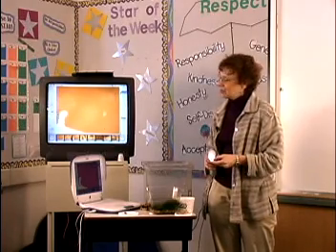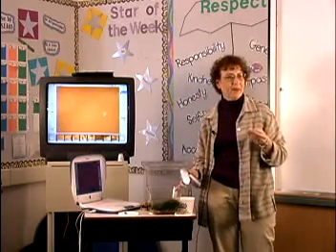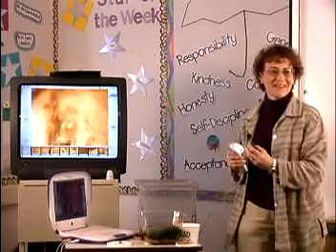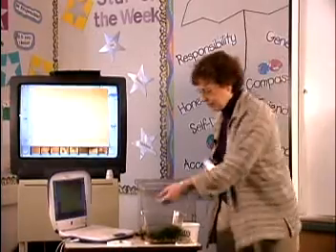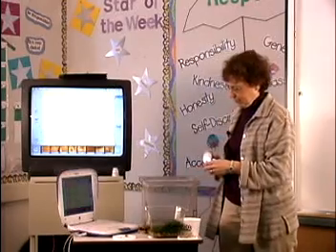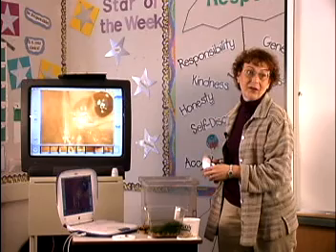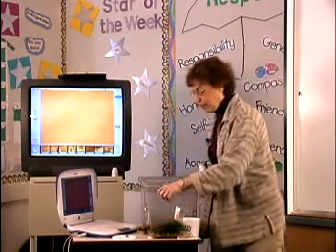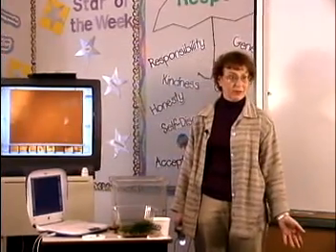Now, judging from just the size of the eye at the end of this stalk versus the size of the eye at the end of the crustacean stalk, who do you think can see better? Nicole? The crustaceans, exactly. I'll show you again on the crayfish the size of his eye. He's got the biggest one of all, doesn't he? And we're going to talk about how that's going to affect what he needs to look at in his environment and how well he's going to be able to see it.